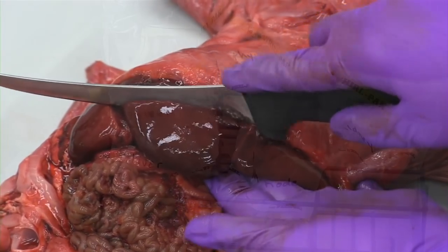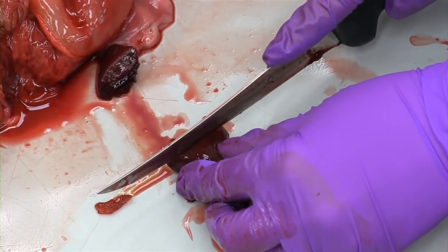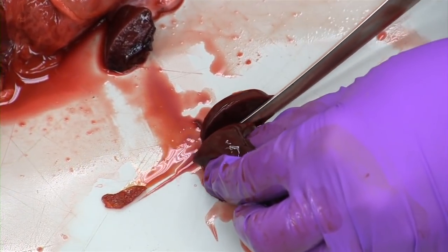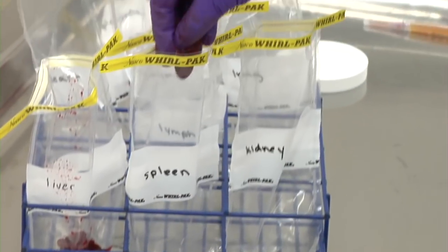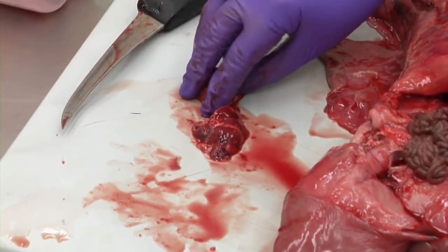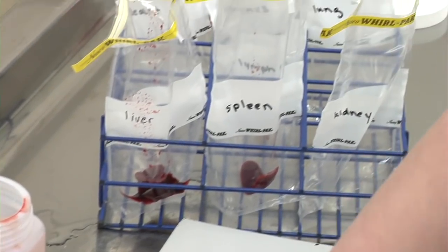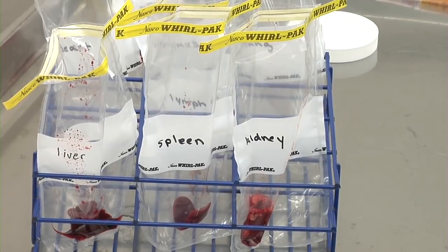Next take two sections of liver, place one in a whirlpack bag and the other in formalin. It is important that all sections of tissue to be placed in formalin be less than one centimeter in thickness. The exception is the brain. All fresh tissue should be placed in individual whirlpack bags to prevent cross-contamination. Please do not combine fresh samples in a common bag or container. As with the liver, collect two sections of kidney and spleen, one for a fixed sample and one to remain fresh in a whirlpack.